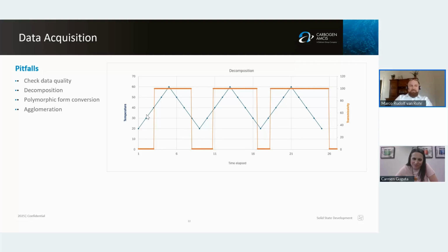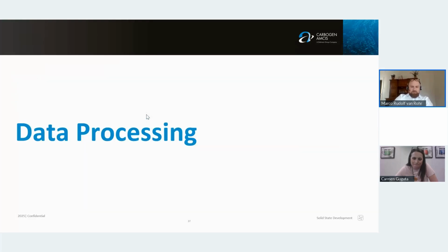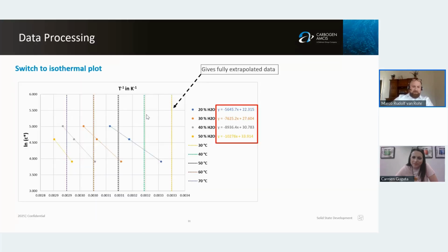I did it a couple of times and checked, but I stay with concentration. If I have something like that, I don't change to mole per mole, because it's getting complicated if you have changing composition. I hope you understand what I mean.